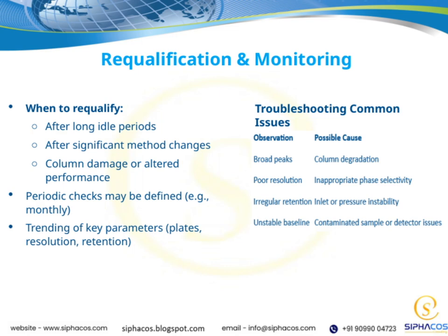Similarly, if there have been significant changes to our method, like adjustments or updates, we should requalify to confirm those changes haven't introduced any issues. Also, if we notice damage to the column or if its performance has altered unexpectedly, requalification becomes essential.